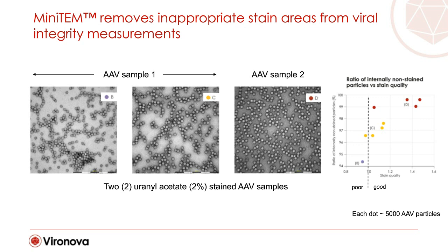So, a related question: what's the best contrasting agent for negative staining for adenovirus? For adenoviruses, we have tried out a couple, and I still think that uranyl acetate is the best one. Okay, thank you. Can you use immunogold to confirm and distinguish VLPs from debris? Absolutely. And the gold particles are chosen very nicely, so you can very easily detect them if you would like to.